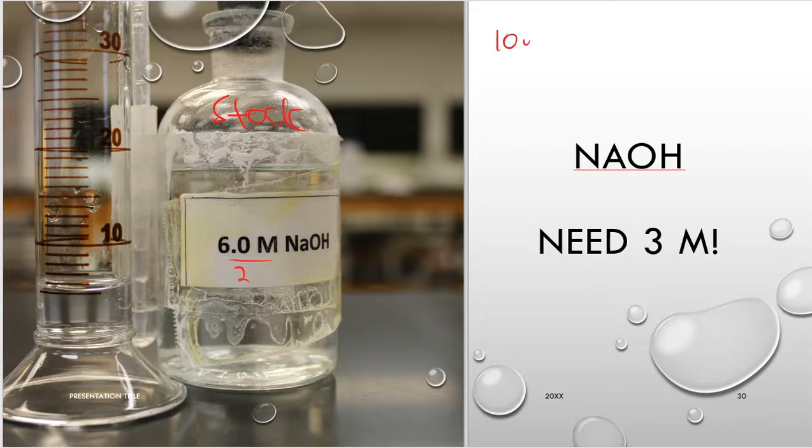For instance, if I need 10 milliliters of a 3 molar NaOH, then I would use 5 mL of the 6 molar and 5 mL of DI water. Because I'm doubling the volume, it will cut the concentration in half by a factor of 2. So this will end up as a 3 molar NaOH, and then I can use 5 milliliters of that solution that I've made in order for the reaction to proceed in the next step and for the cleanup to happen.